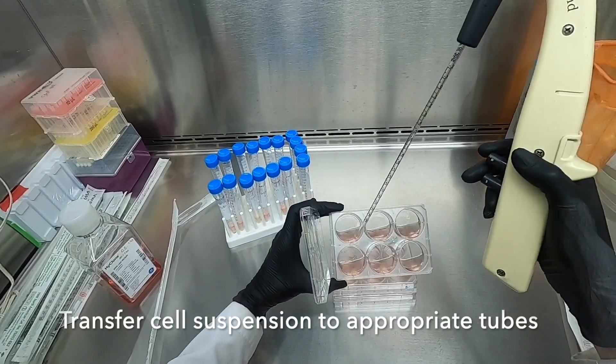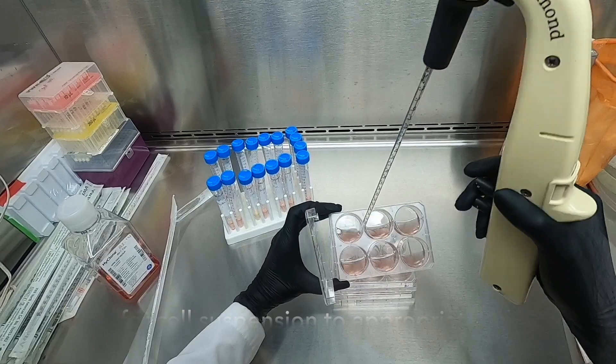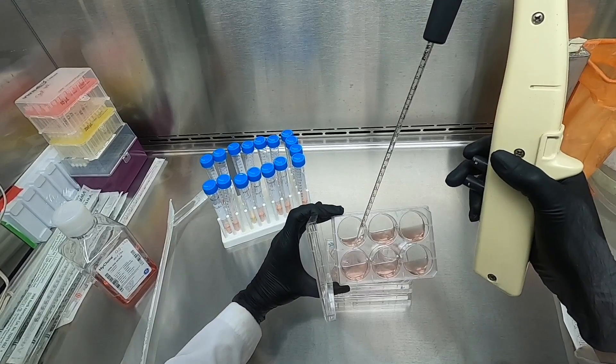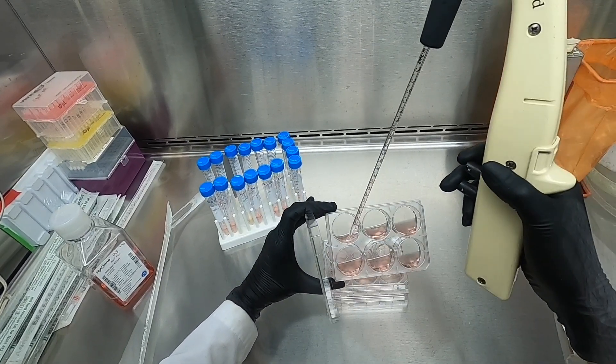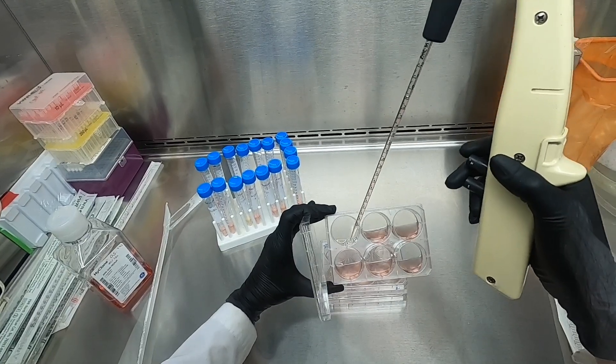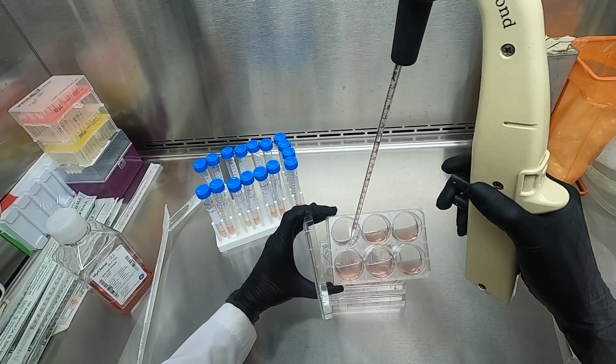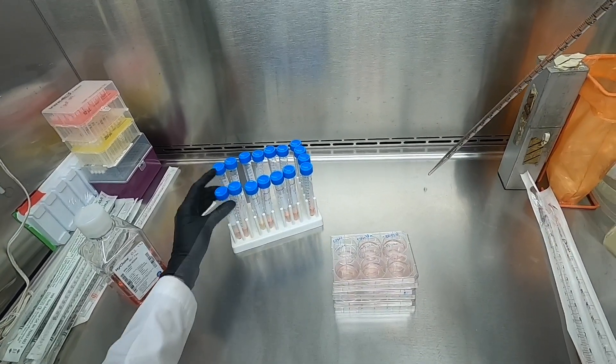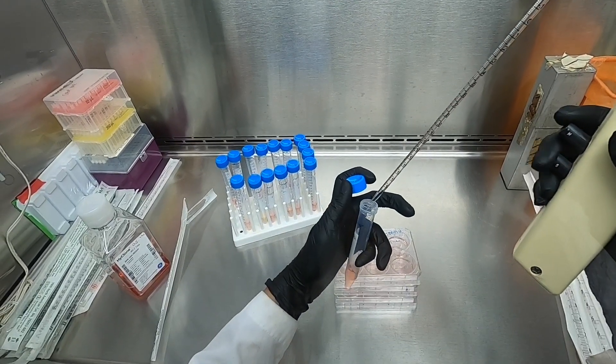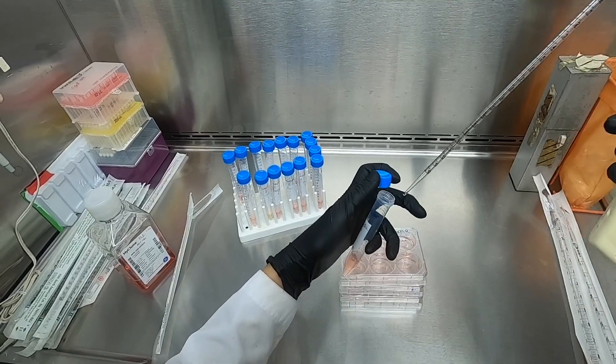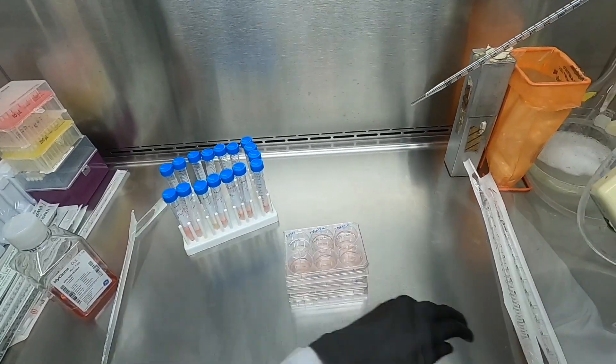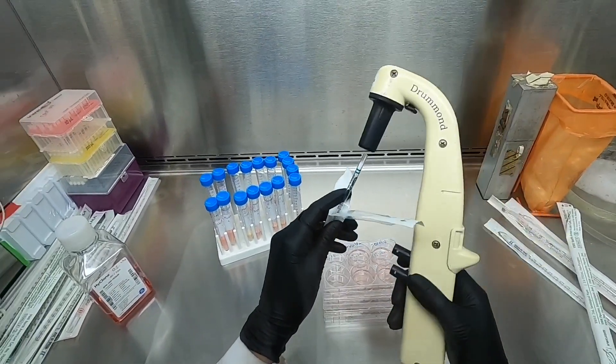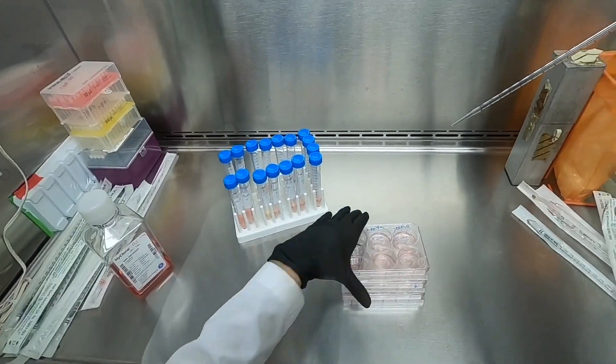After all cells are detached from the plate, we will transfer each well to the appropriately labeled tube. Here, we are rinsing each well with a media in order to rinse off any cells that may remain attached to the surface. We will repeat the same procedure with every single well, making sure that we gather as many cells from each well as possible.